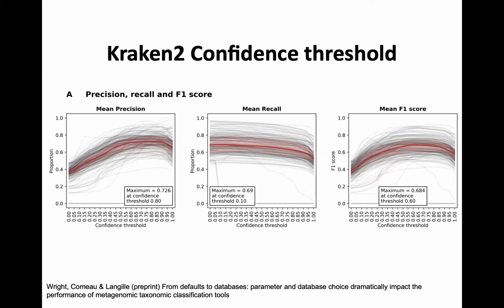Yes, absolutely. So Metaphlan tends to do a really good job on human samples, definitely adequate. And then on environmental, it really, really craps out. There's just more human microbes out there known, and there's a lot more unknown diversity in soil samples. So you can imagine not getting the right markers in a very diverse sample, and so Metaphlan just goes, there's nothing here for me. And they also tend to focus more on human samples, so they did a lot of their validation that way. I mean, you can still use it on environmental, but it just tends to be less.